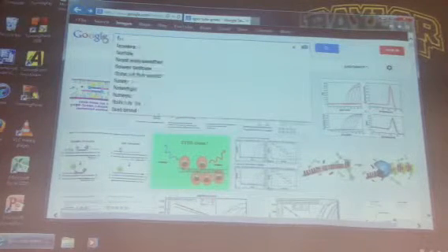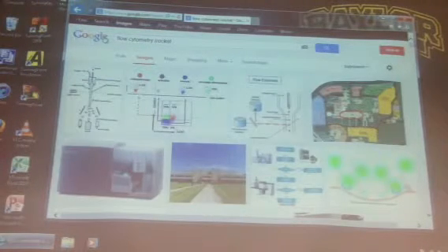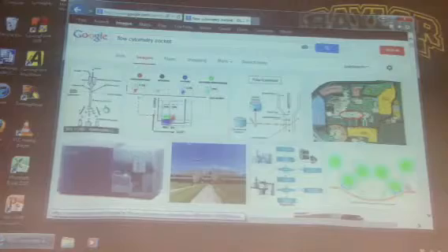So let's move on then to flow cytometry. I found a really good site for this at the University of California, San Francisco. Just for their training, they have something called iRocket. So we'll go and study flow cytometry from iRocket.